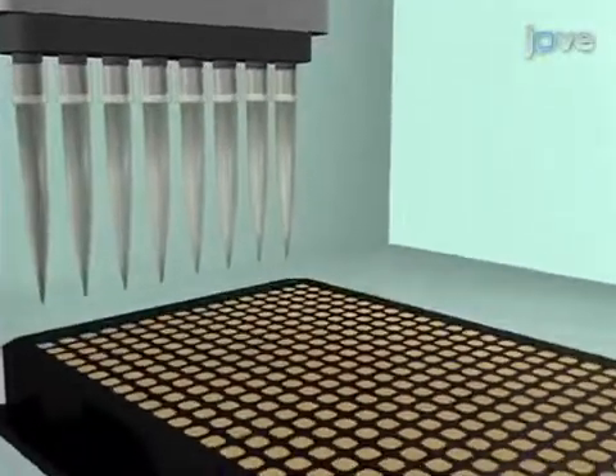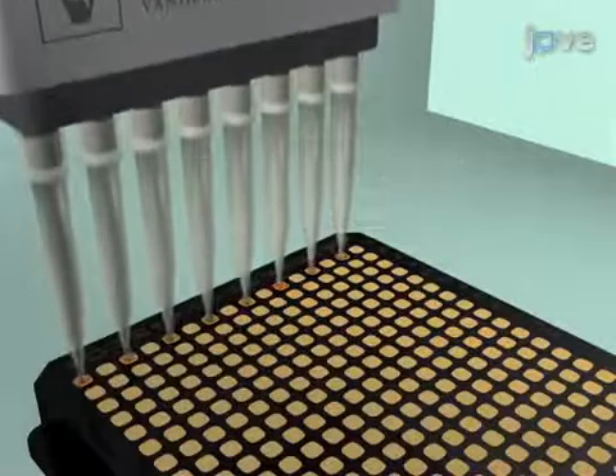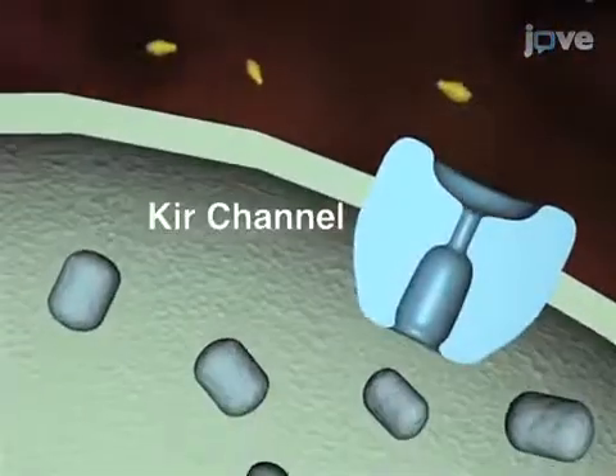Next, the unincorporated dye is washed from the cells and replaced with assay buffer containing a vehicle control or test compounds. The final step is the addition of a stimulus buffer to the wells to initiate thallium flux.